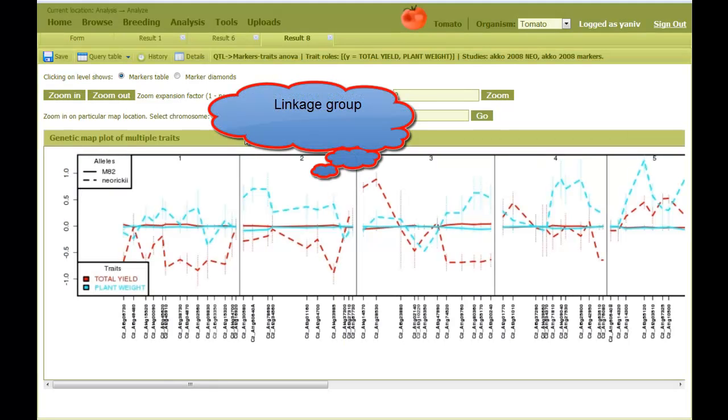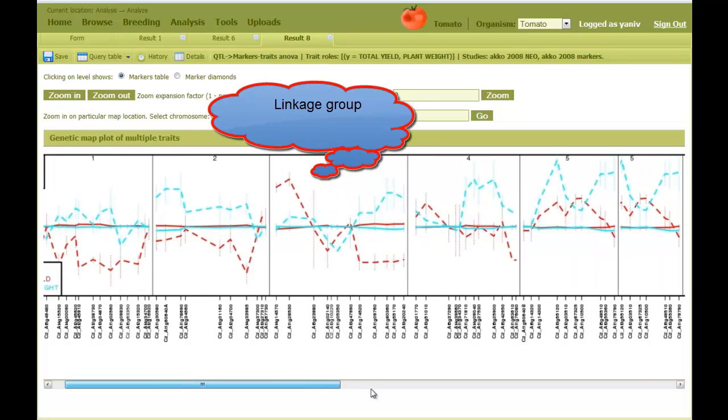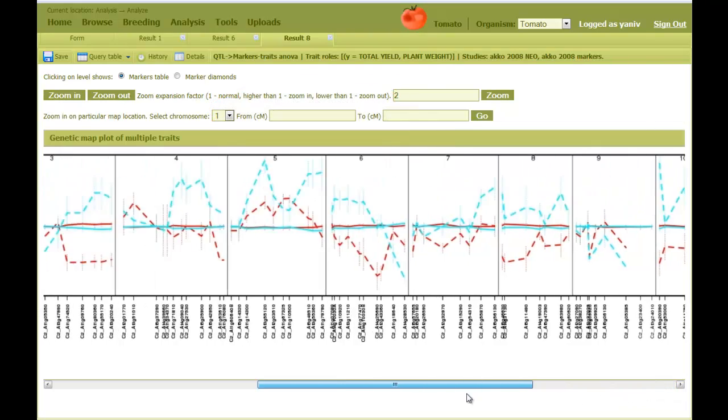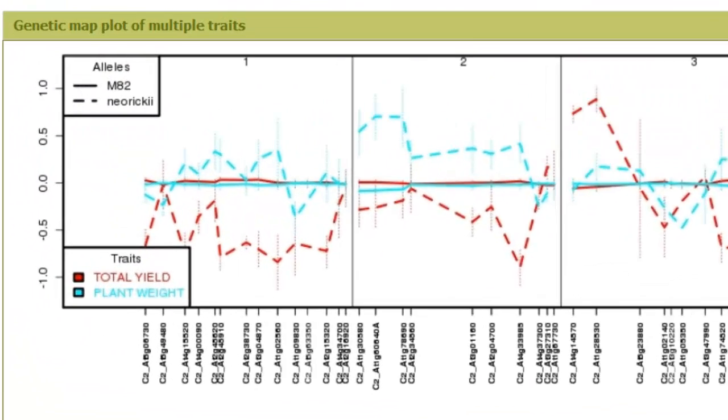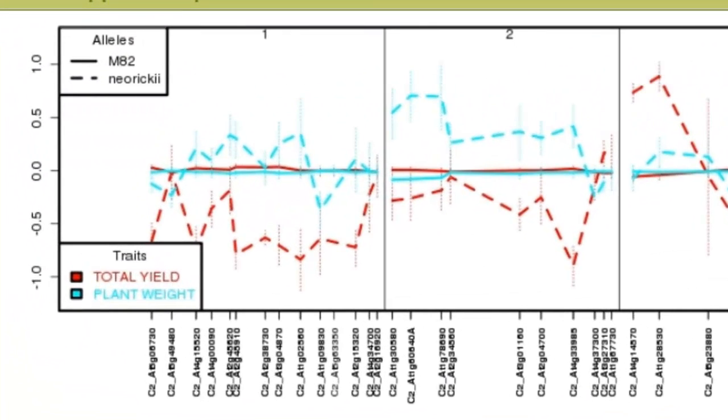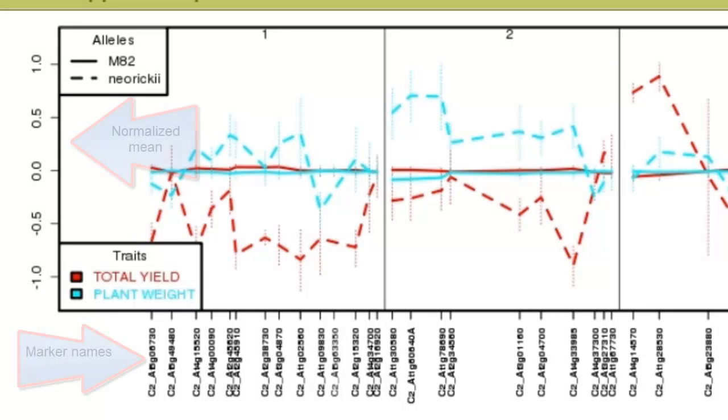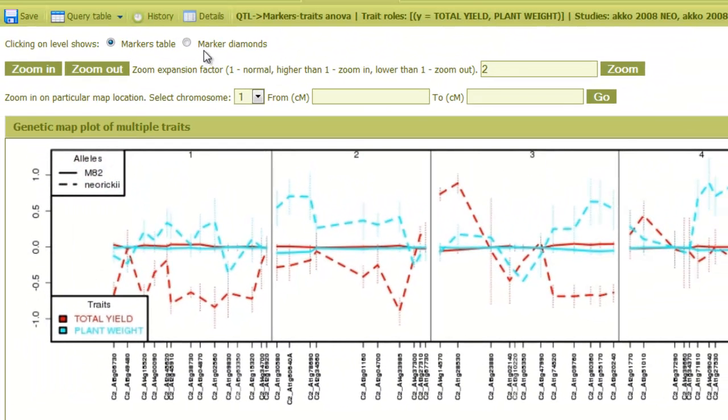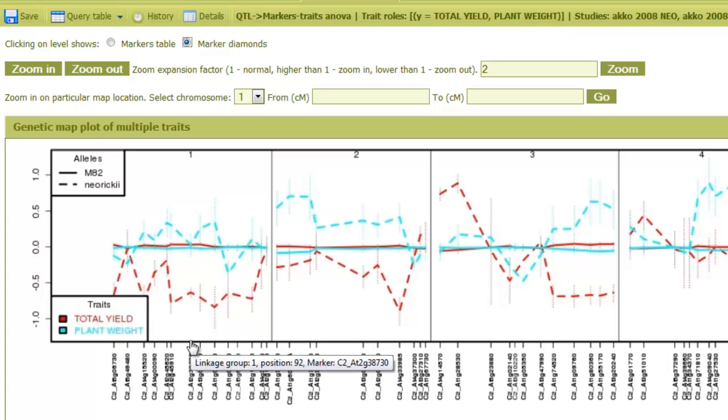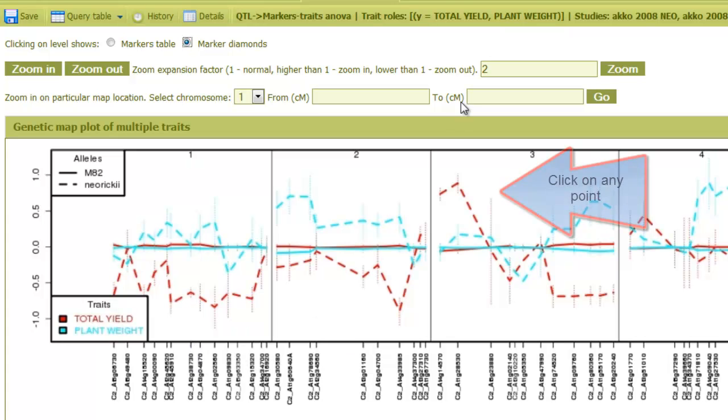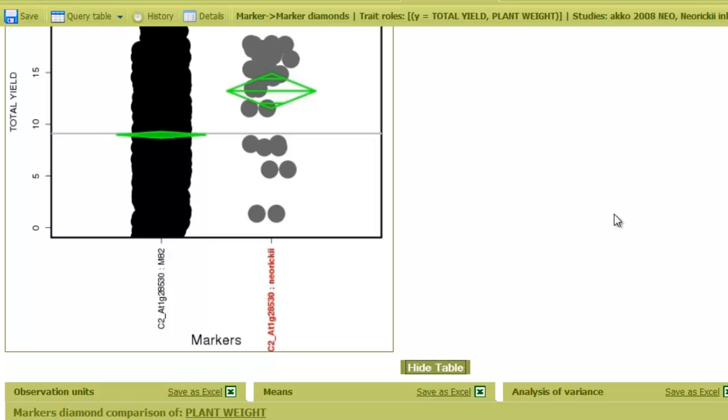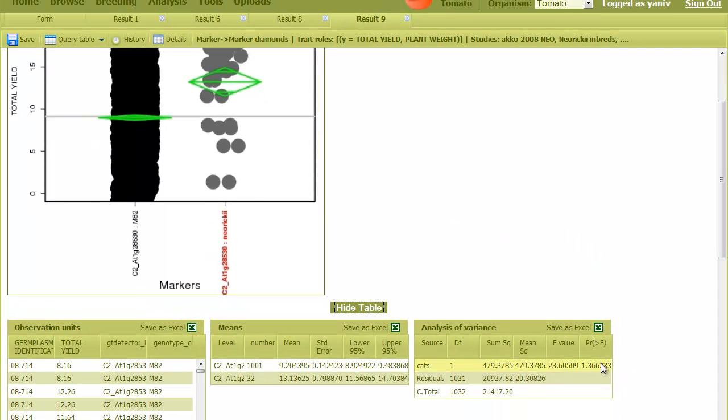Each panel represents one of the linkage groups. A solid line indicates the mean of all genotypes with the M82 marker in that position, while the dotted line is the mean of all genotypes with the Neoreki marker in that position. Vertical dots are the standard error. I can check the marker diamonds checkbox and click on any region in the figure. A statistical comparison is displayed in a new tab between each of the genotypes groups. The analysis of variance table and the p-value can be displayed.